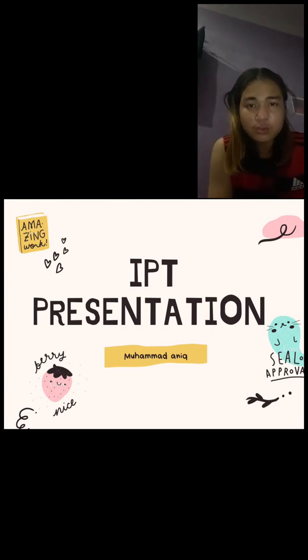So today I want to do a presentation for introduction to pharmaceutical technology. My topic is the hardness test and friability test.